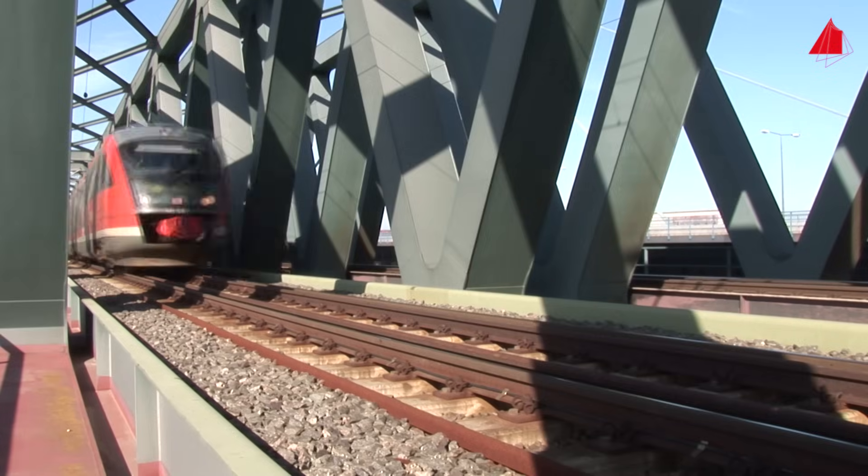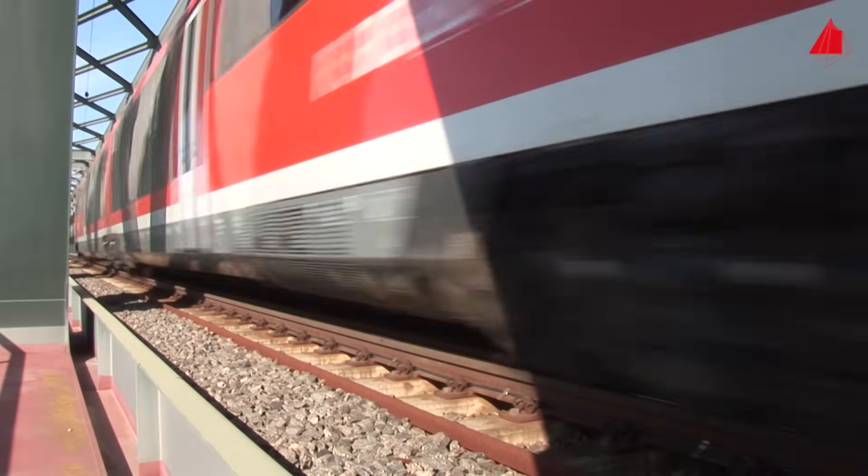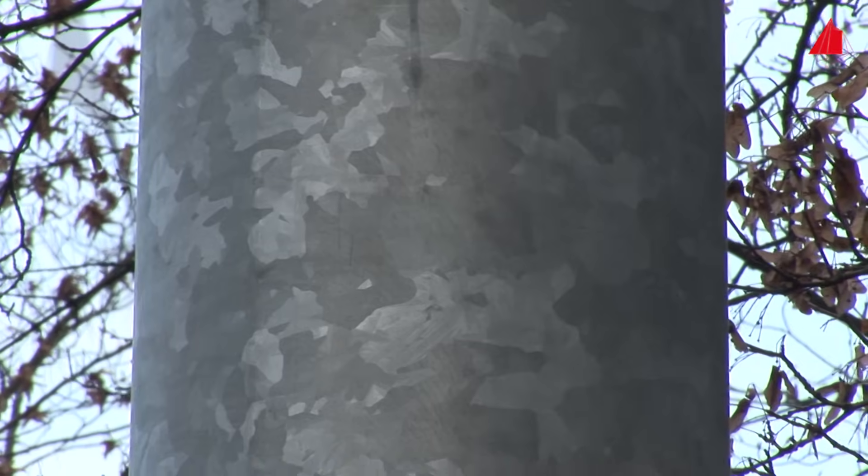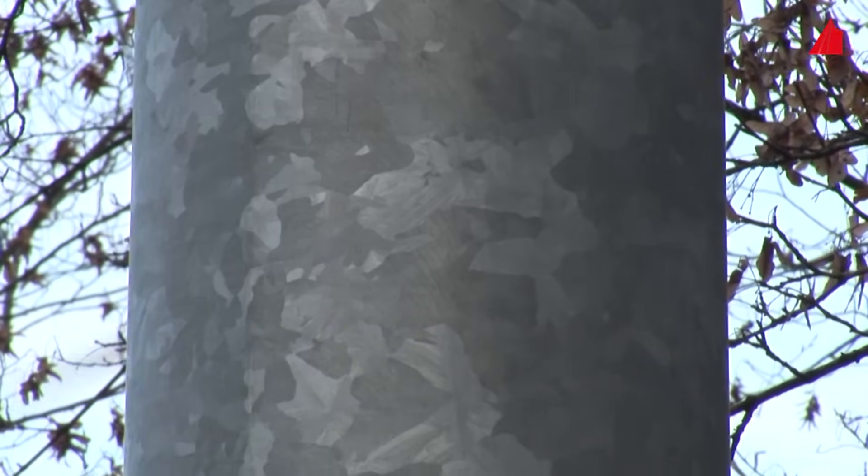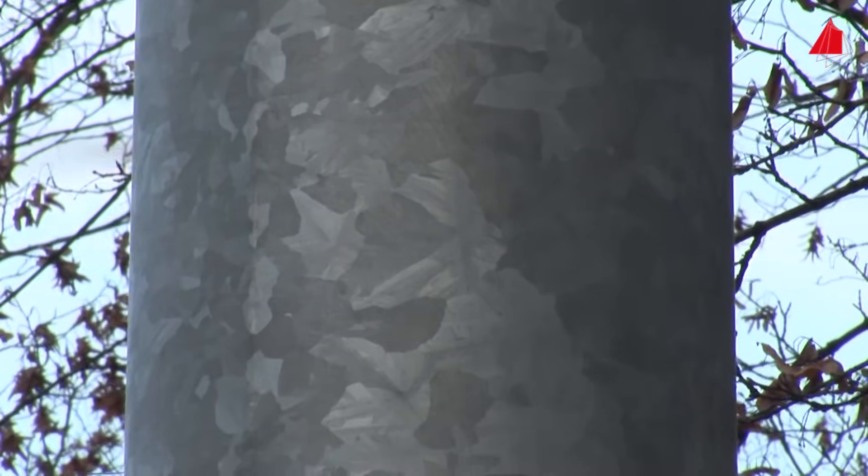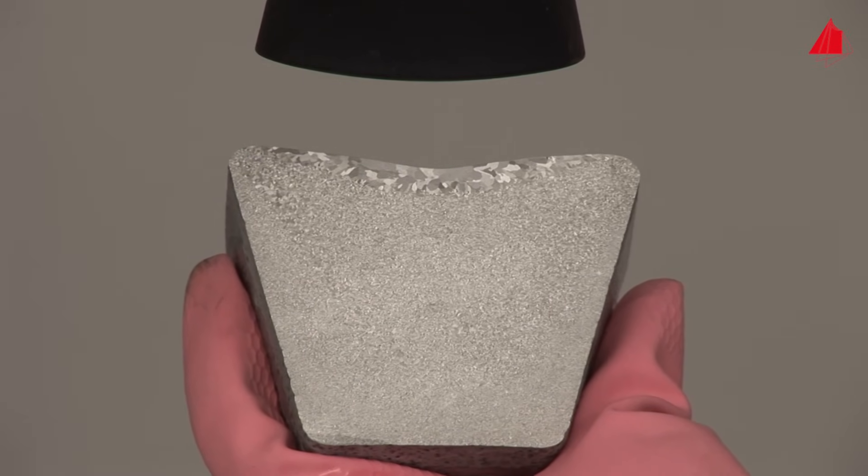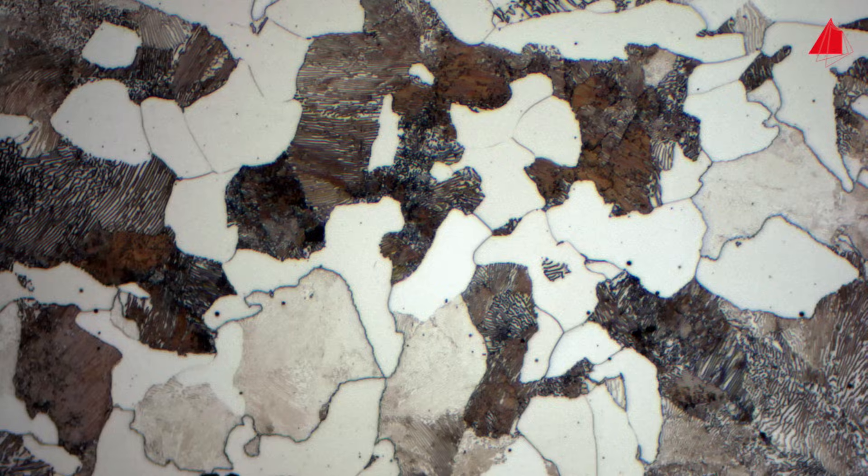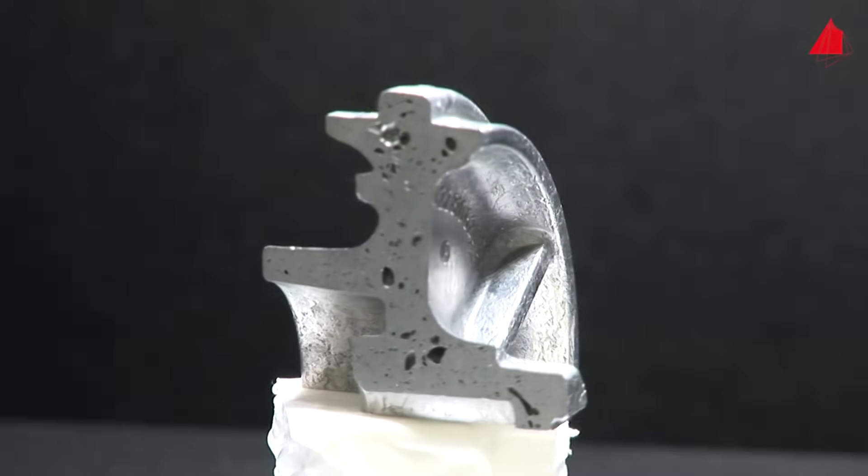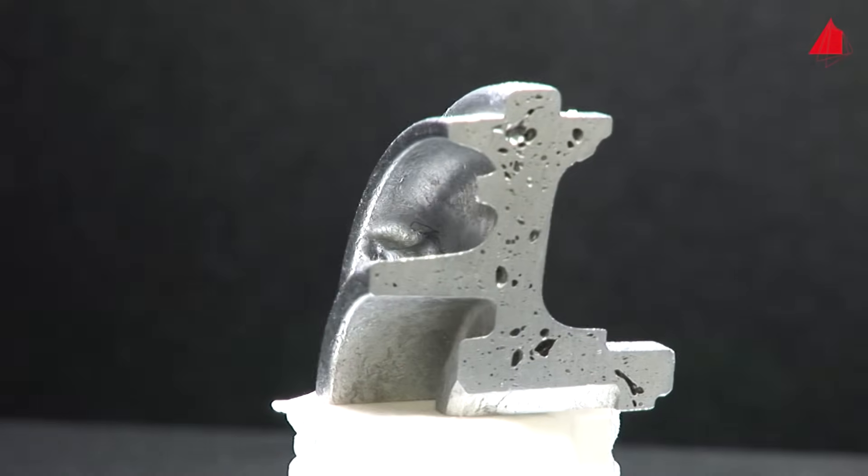Metallic materials are widely used in many areas of everyday life. How are they built up internally? Are there perhaps crystals to be found? And if so, how big are they? What kinds of crystals are there? What is their shape? And are there voids or inclusions? Metallography gives an answer.